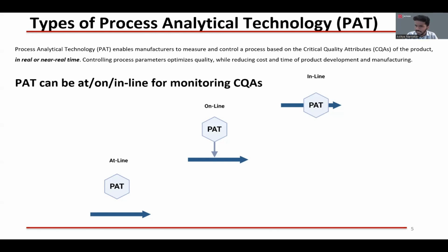Now, in case of inline analysis, basically this involves probes like Raman, IR, and near IR analysis for these kinds of workflows. I'll be focusing on at-line and online analysis in the work that we are doing at our lab at Rutgers University.